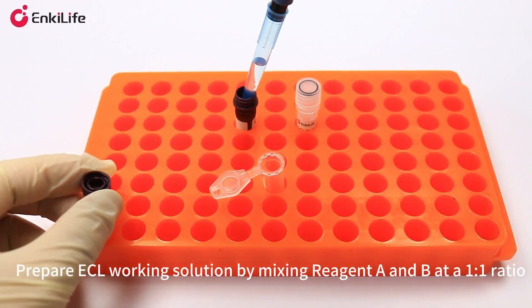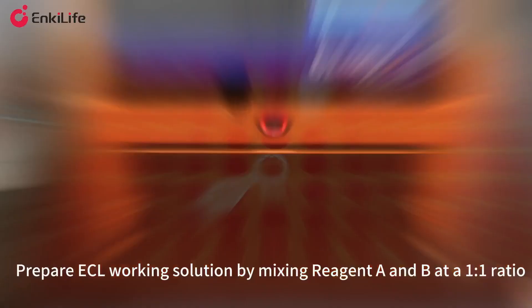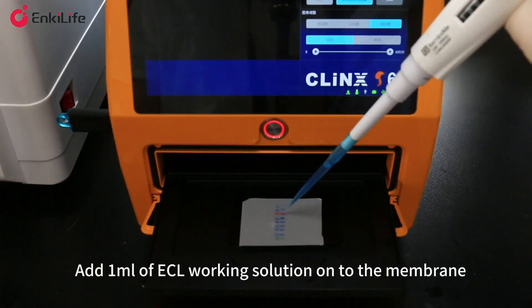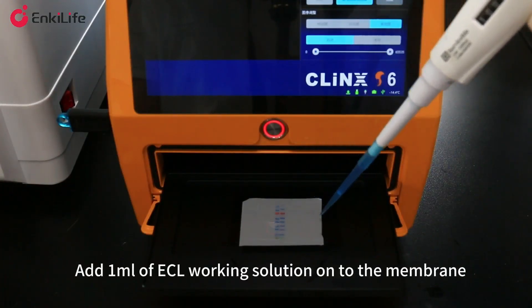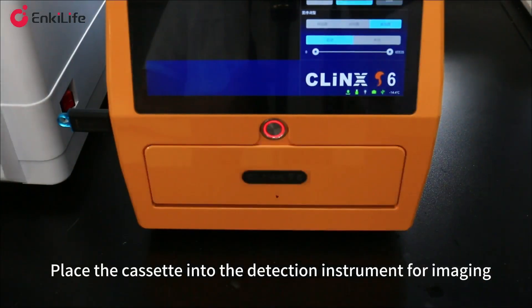Prepare ECL working solution by mixing reagent A and B at a 1 to 1 ratio. Place the incubated membrane into an imaging cassette, add 1 milliliter of ECL working solution onto the membrane, then place the cassette into the detection instrument for imaging.